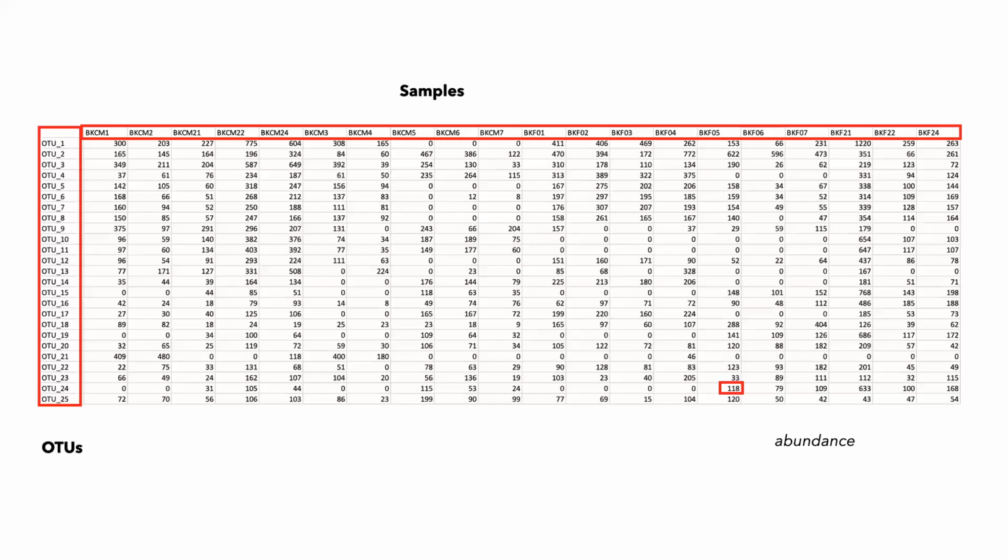We see the abundance table. So what is the abundance table? It has different samples. Okay, this is many more samples than we have in this demo pipeline, but we will just have names of samples in the abundance table and OTUs. The fewer OTUs we have with zeros across, the better it is for us to analyze. Okay, and this number is the abundance of that OTU.